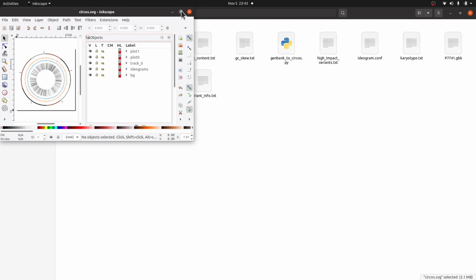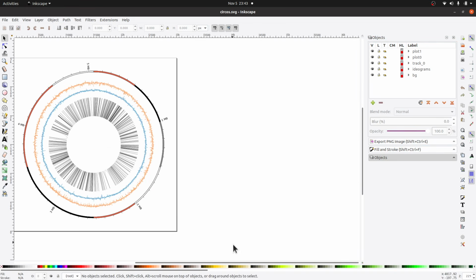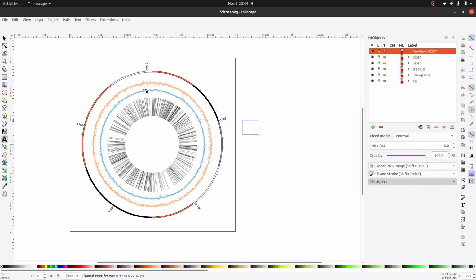So like have it this way. So once I have it, I can do some modification. If, for example, this text here, I want to add something, I can just add it. Let's say, yeah, you can add some files to it. Okay. So all those things can be done.